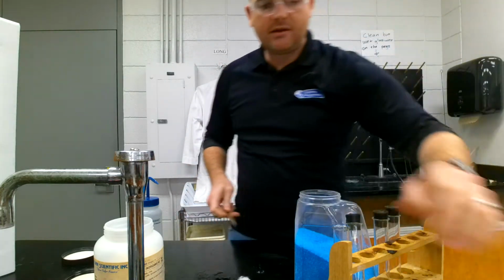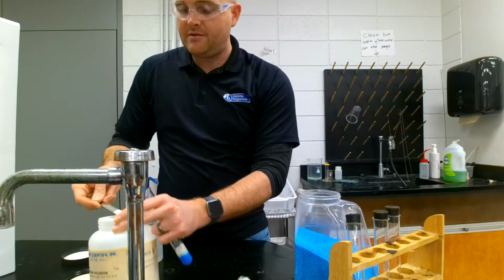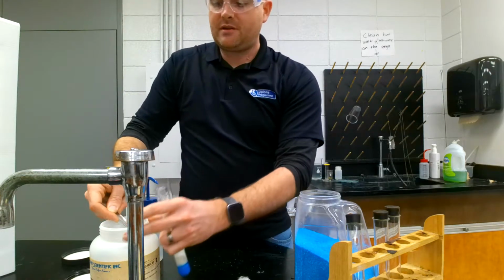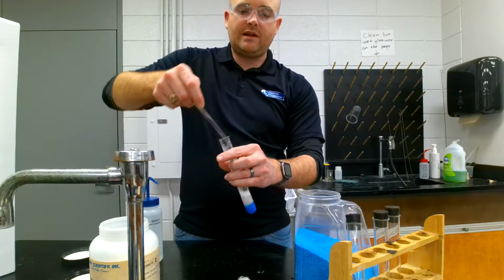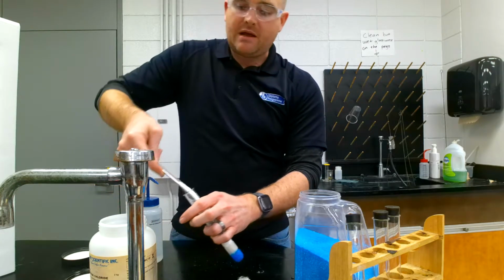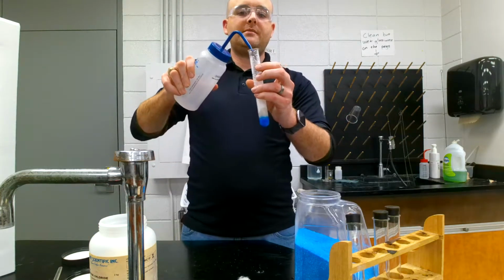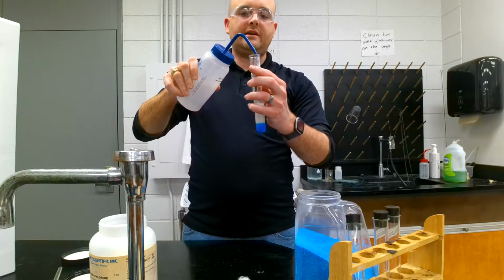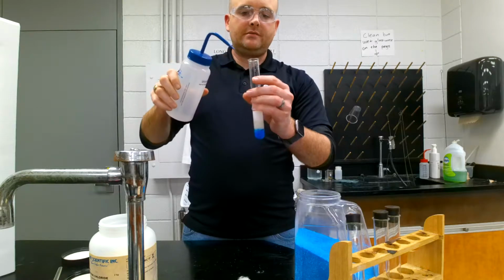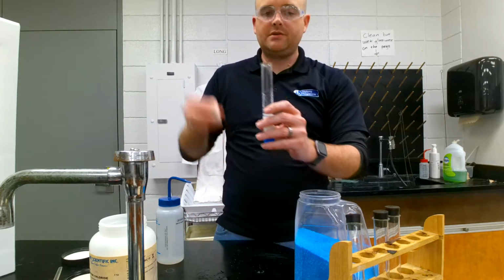A wet spatula in my pure sodium chloride, my pure salt, would not do well. So, as you can tell, the salt likes to stick to the outside because it is wet in there. I'm going to put about another 2 centimeters, which is about 3 scoops. It's very non-quantitative. And then I'm going to spray water on the outside to try to get all that sticky stuff off. Okay. And voila, we should be good.